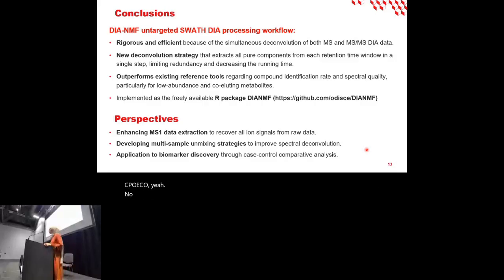No, it can be applied to DDA for sure, because it's much easier than DIA. But now the R package that we just launched works just for deconvoluting MS1 data plus DIA data, but it can be done easily.